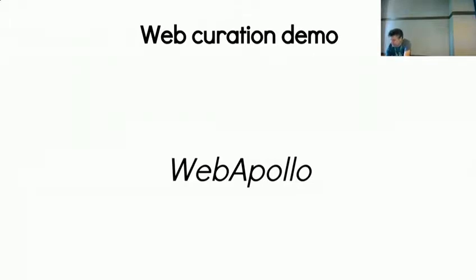Having two side panels is probably not the best thing, so we're going to close that. Once it's in there, there are different types of annotation. If we have additional evidence, we can change the structure of these. We can do things like deleting exons, basically all those types of structural annotations.